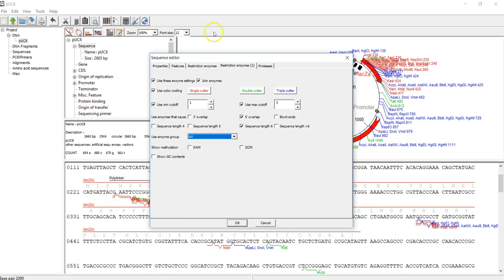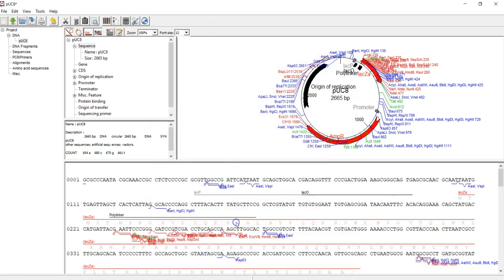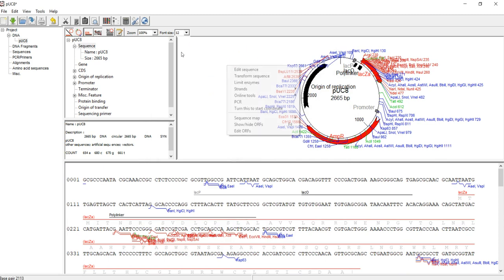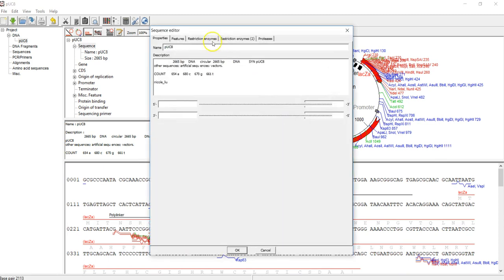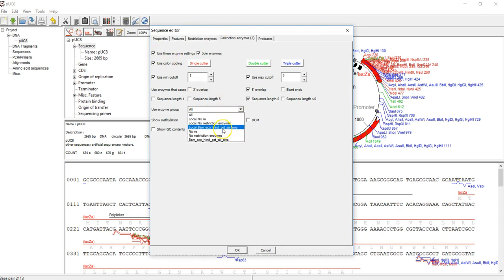I don't have it yet, so maybe I need to save and close. Save this. Now try again, reopen. You choose the group, then you click OK.